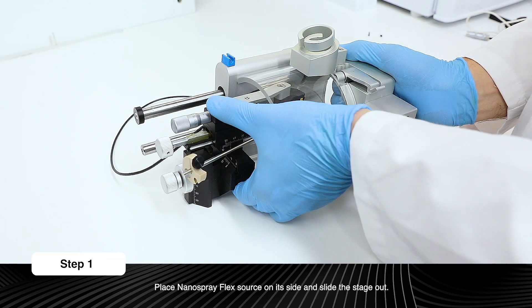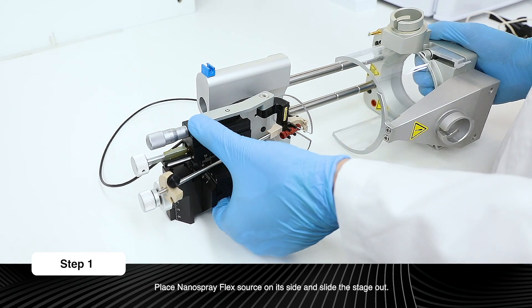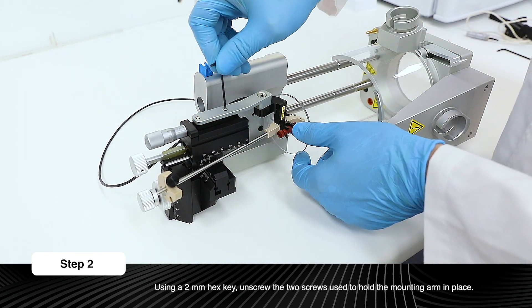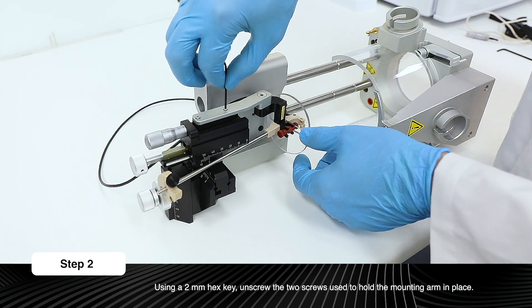Place the Nanospray Flex Source on its side and slide the stage out. Using a 2mm hex key, unscrew the two screws used to hold the mounting arm in place.